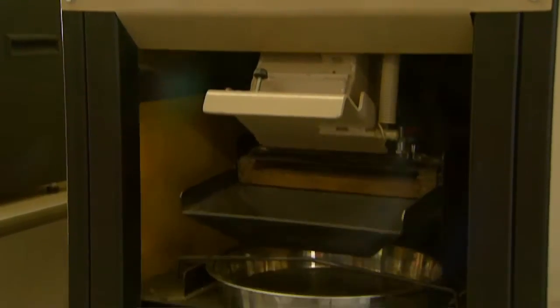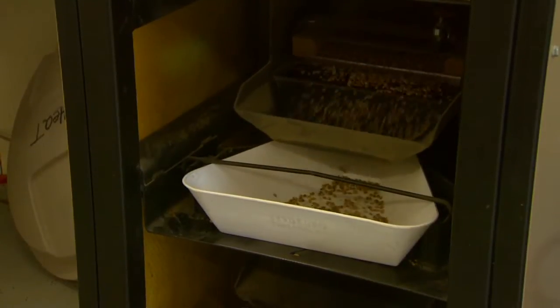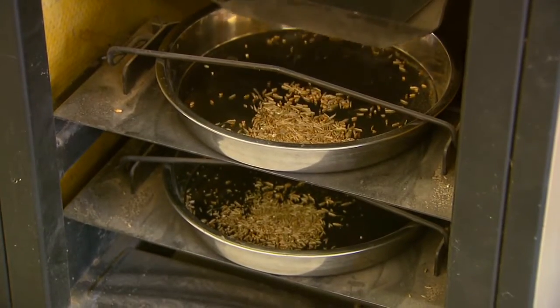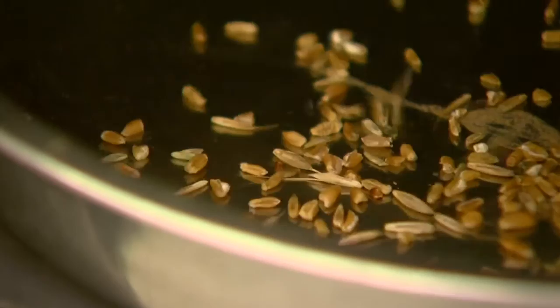What this dockage machine is going to do is go through, clean the wheat, and separate all the trash and particles out of it. You have the aspirator on the top, then a riddle that takes off the big stuff. You'll have the clean wheat, shrunken and broken kernels, and dockage — the real little stuff comes out in the bottom pan and the real big stuff on the top.